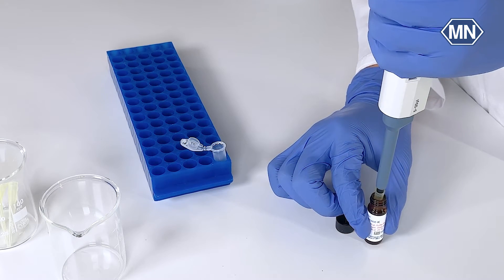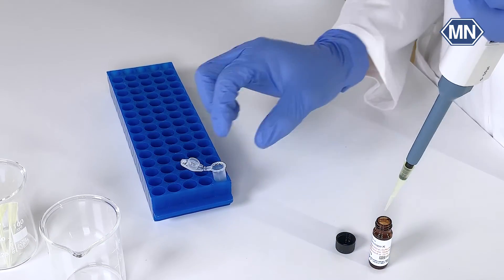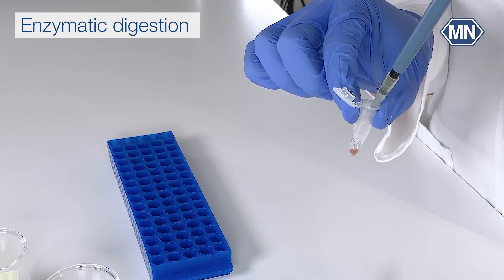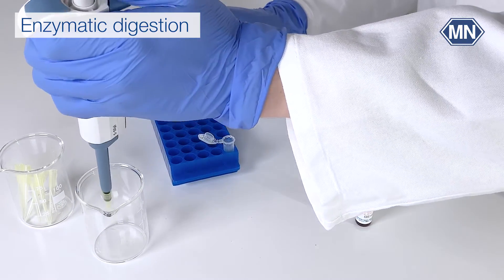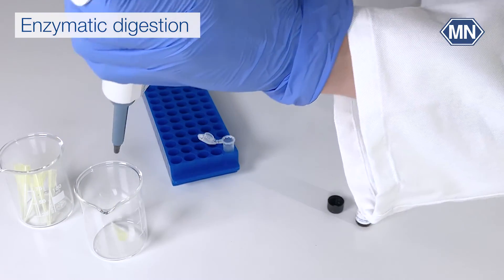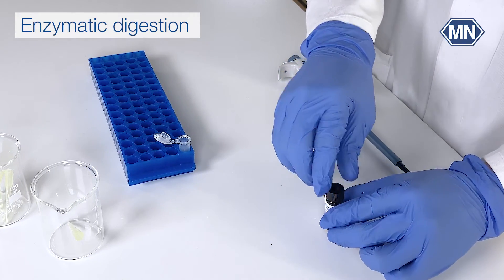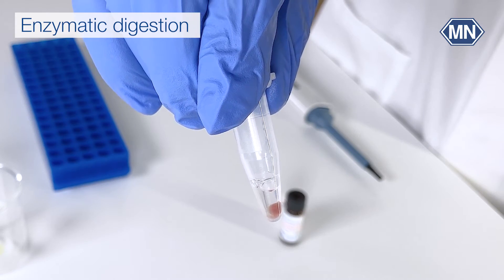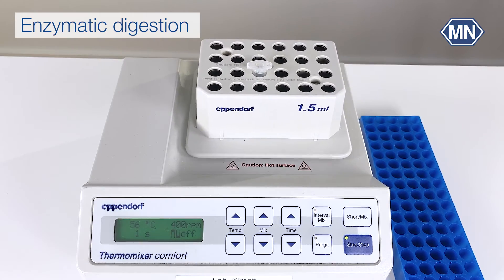To use it, simply add Proteinase K to your sample in the presence of a suitable buffer, and incubate at the recommended temperature and duration as specified in your kit's manual.